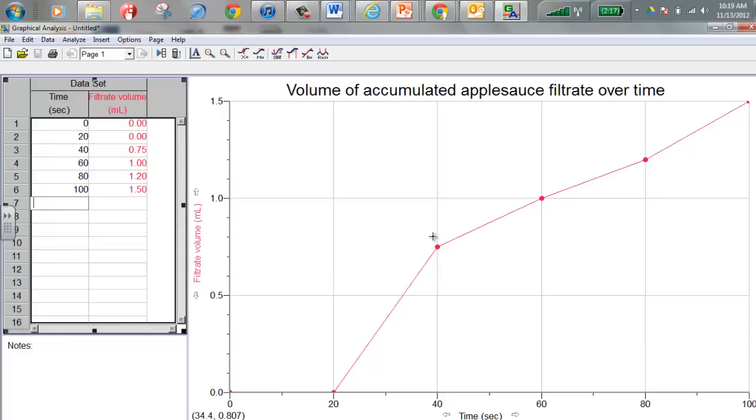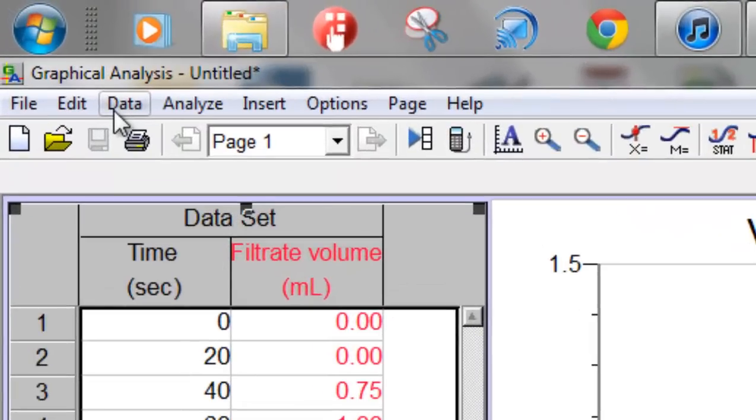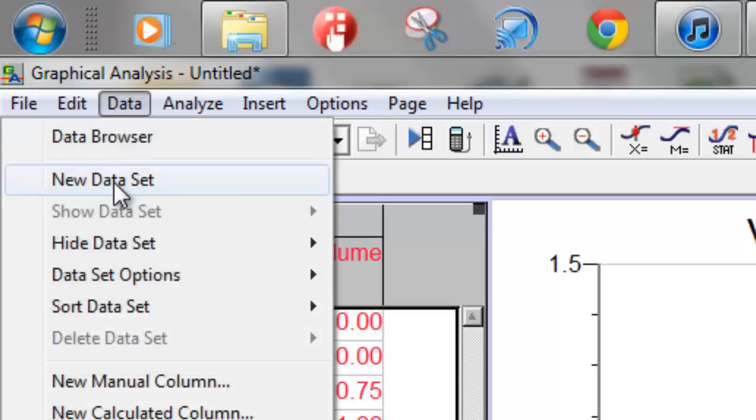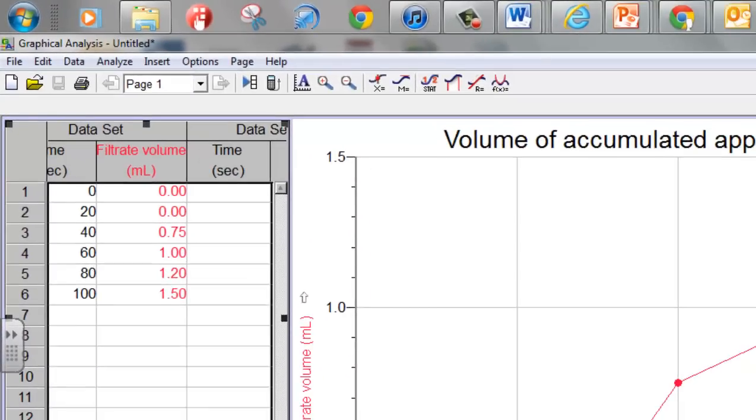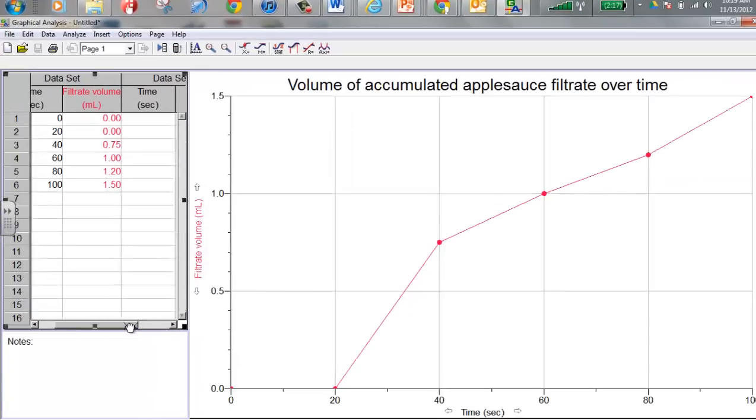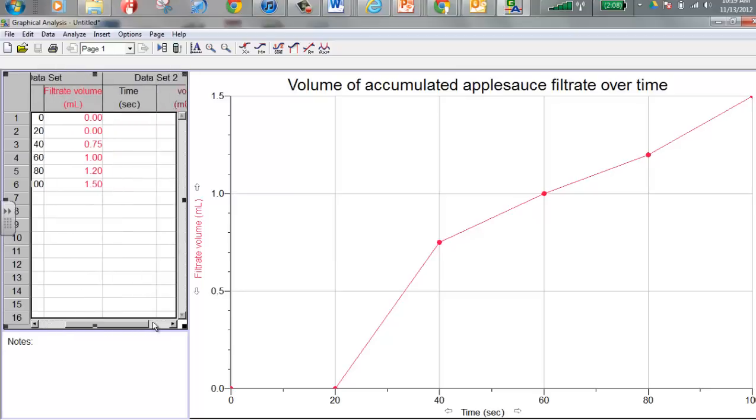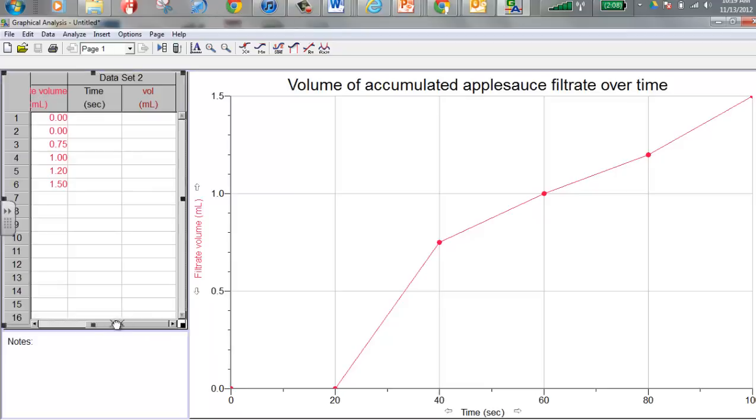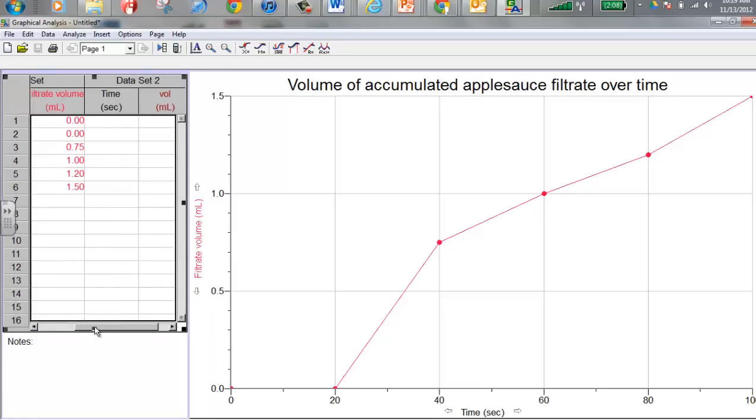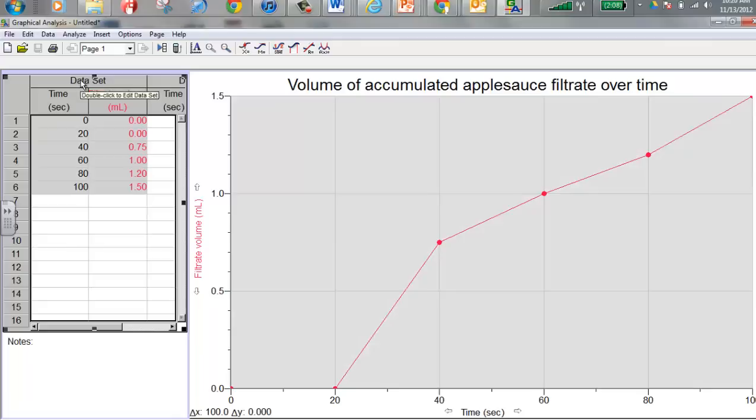This is one graph, this is a fine graph, but if you want to compare this with another situation - and don't you want to do that, aren't you trying to compare two different situations here? - wouldn't it be neat if I could put two lines on one graph? So that's what I'm going to do. I'm going to choose the Data option from the menu here and then here I'm going to select New Data Set. And look at that, I have this window here and I can scroll over to enter a new data set.